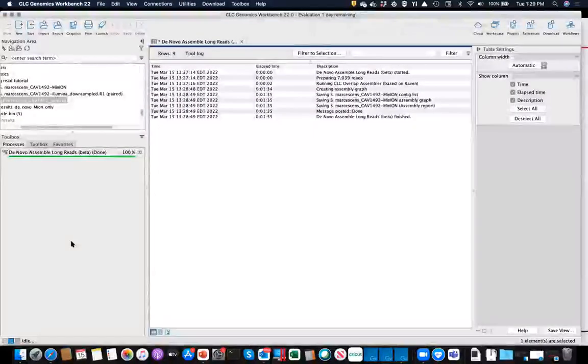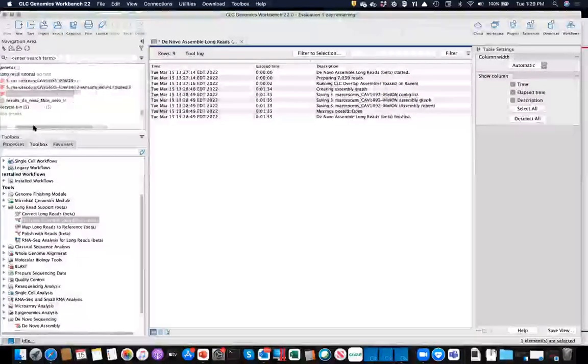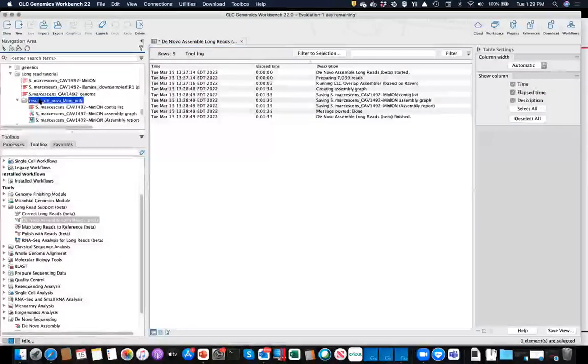Thank you, Deb. So we can look at the log file. Again, it really didn't take much time, a minute and 35 seconds to assemble those 7,000 reads on my laptop. And now, let's always take a quick look at those results.